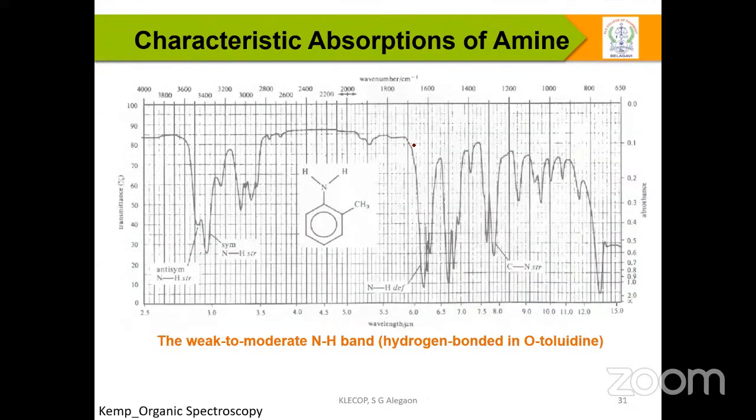Next, if I take amines, these can play a more important role in bonding and non-bonding character. Here also we get the same peak, but not a broad peak as observed in alcohol. Sometimes people call it a shoulder peak, sometimes a two-peak system.